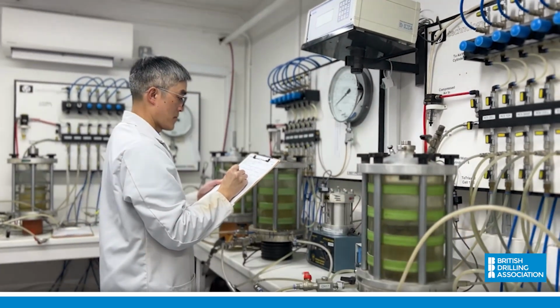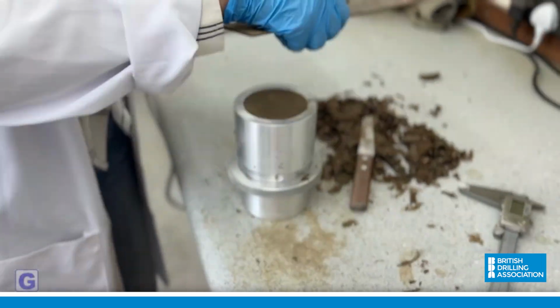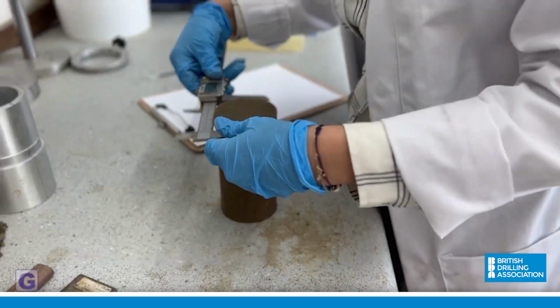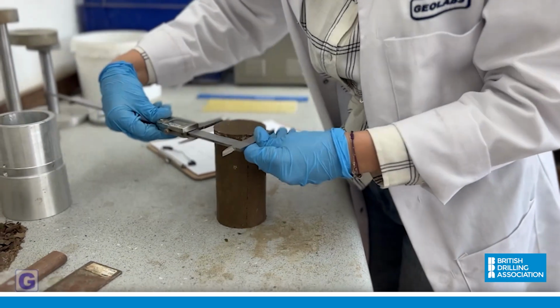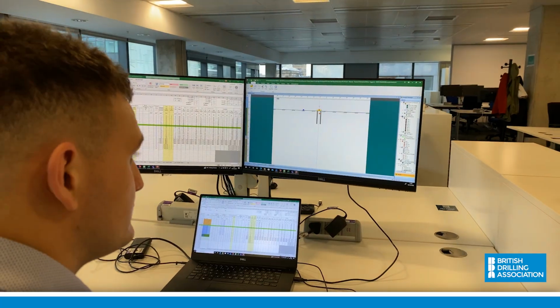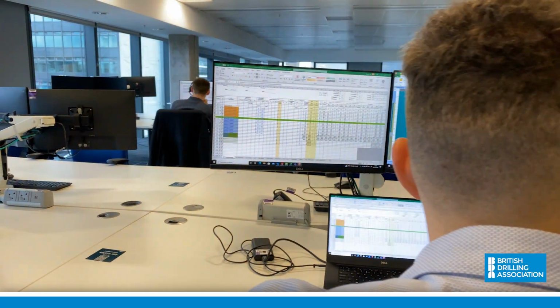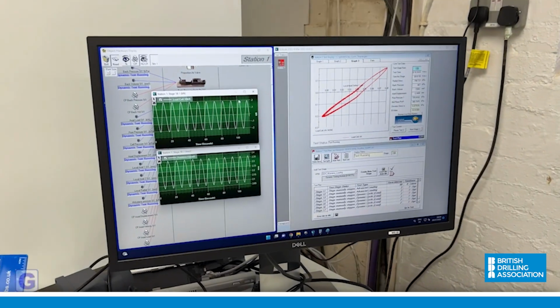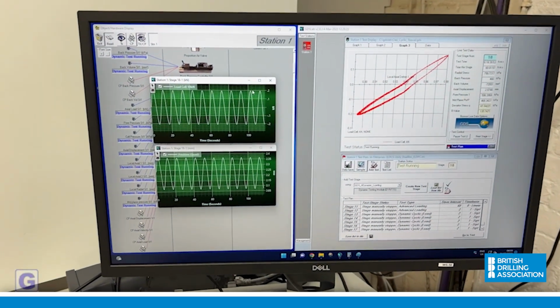That would be a lot of work, money, and effort, all for very little return in terms of accurate design parameters. After completion of the testing, the results are typically entered into geotechnical database software or other laboratory information management systems, which facilitate data capture and the reporting process.